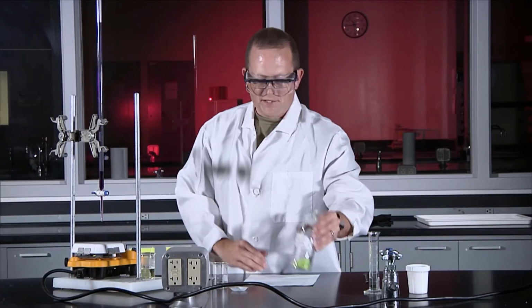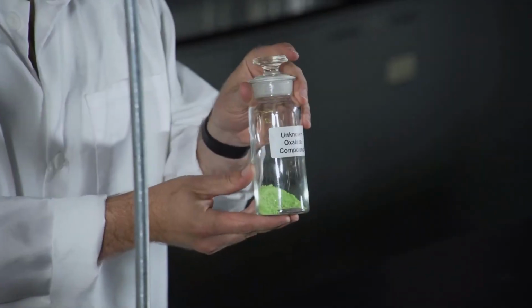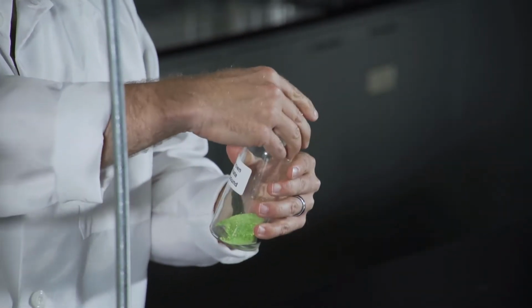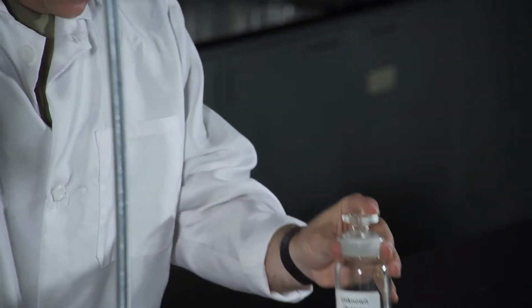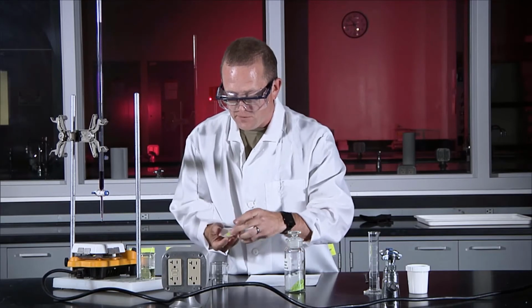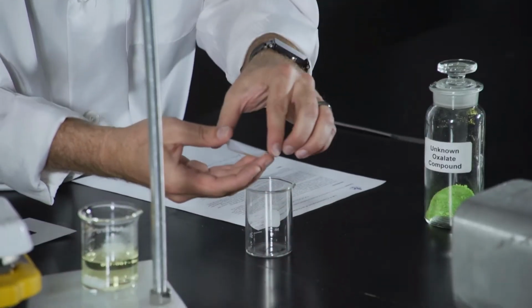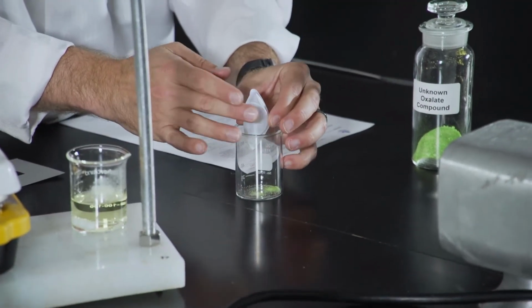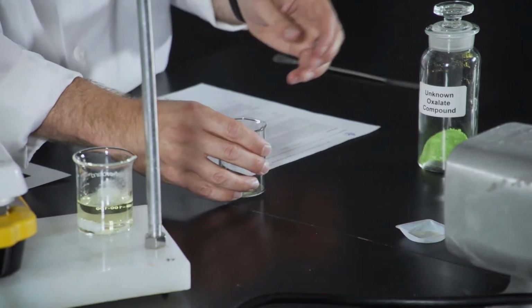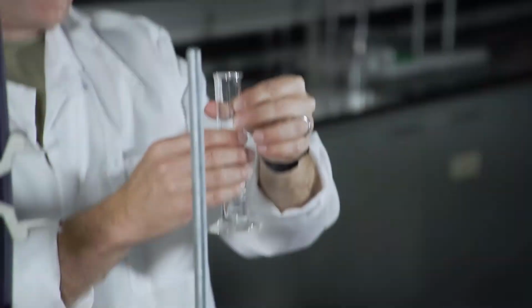Now this is the oxalate compound. It has an oxalate ion inside it. We want to measure out approximately 0.1 grams, and here we have approximately 0.1 grams in a little weighing boat. So we're going to put this in the beaker, and we're going to add to that approximately 15 milliliters of sulfuric acid.